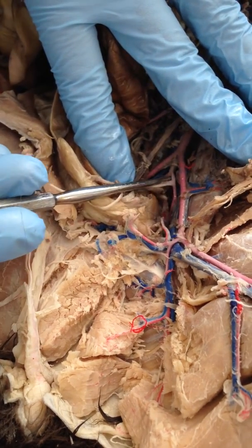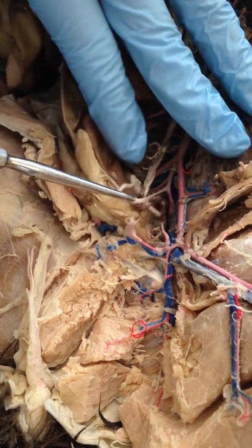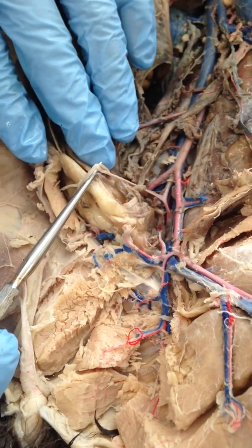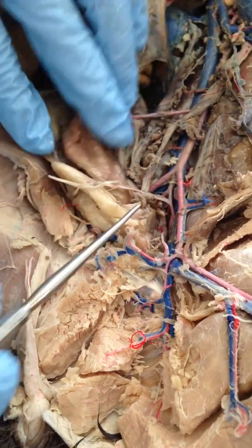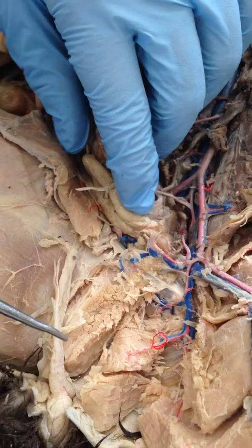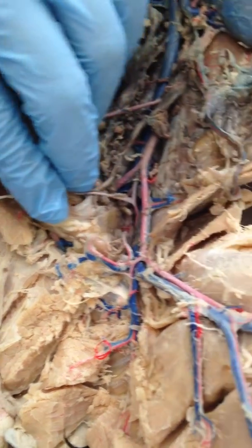So external, internal. The internal goes into the... We only trace the internal iliac. Okay, so we don't worry about all these things coming off? No. Okay. I think that's the majority of the arteries.